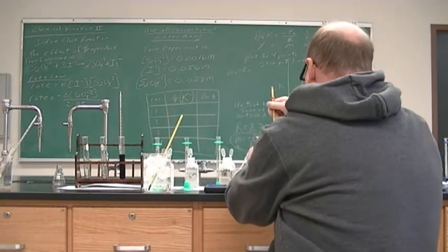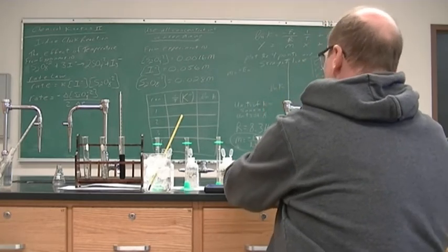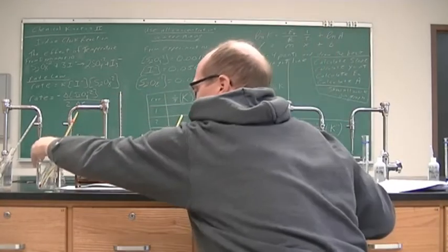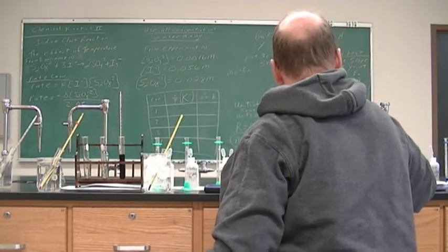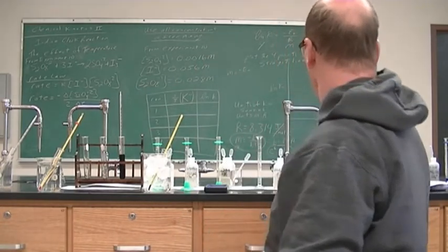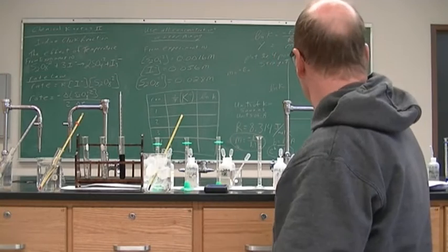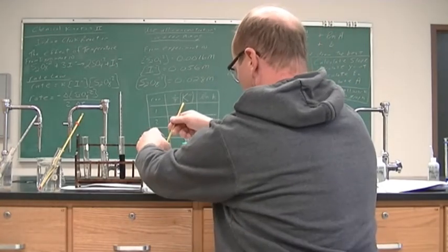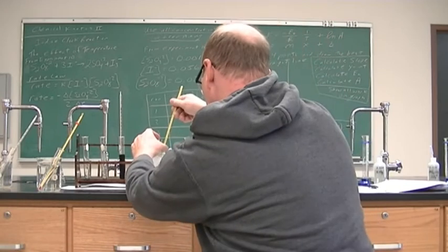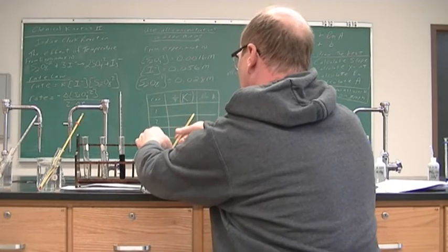All right, so our reading is actually 10.3 degrees Celsius. So we're getting closer to the, so it was down 11.7 degrees Celsius instead of down 10. All right. Make sure my temperature here is good. Yep, it is still at 2 degrees Celsius from the ice bath.